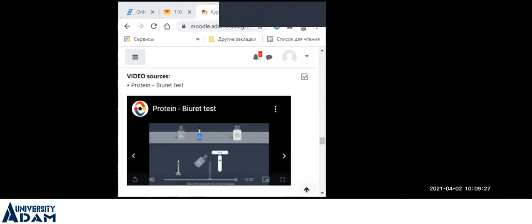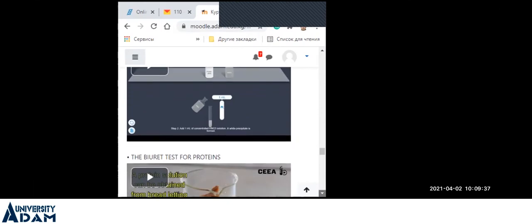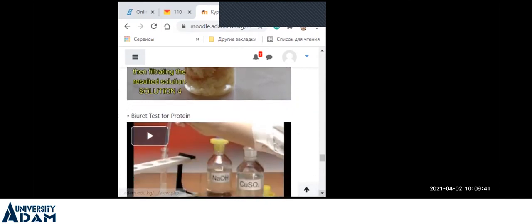It's just about the biuret test in general. Let's see some details about this research, this identification. These two videos show us.